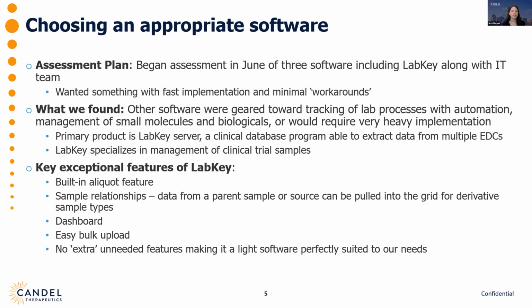Some of the features that really stood out as we were demoing were the ability to track aliquots, and how each blood derivative can have, at least in our case, many aliquots, like 5 to 10 aliquots. So being able to track those relationships was key. And also the way that Sample Manager handles different relationships between samples.